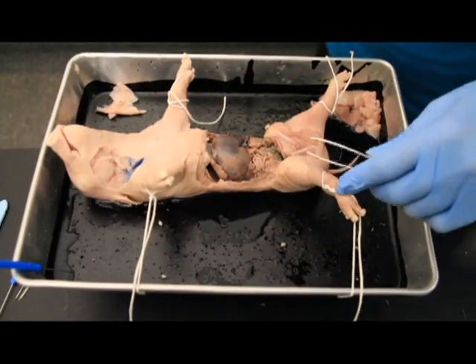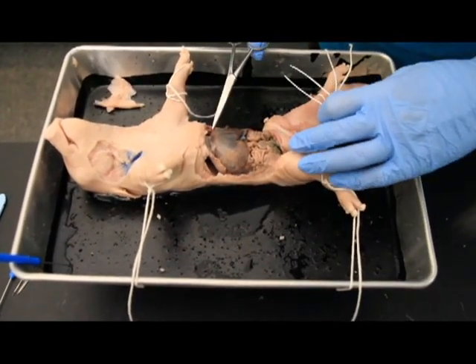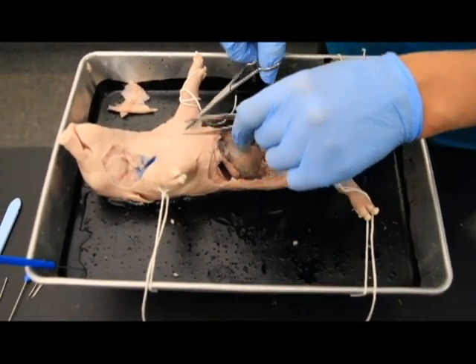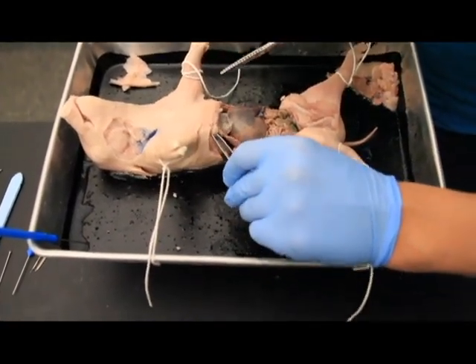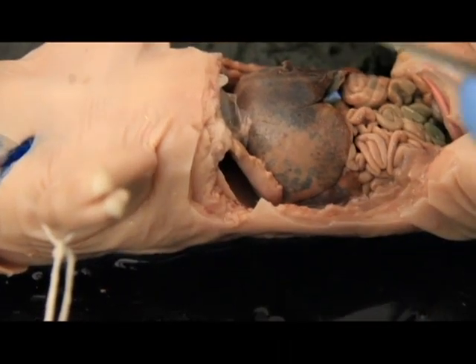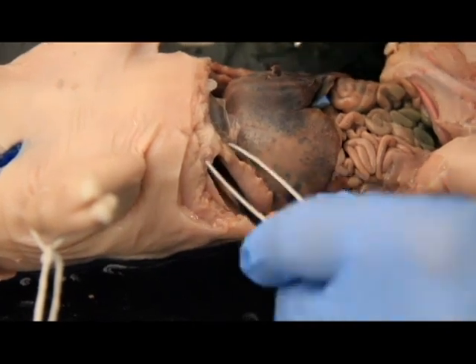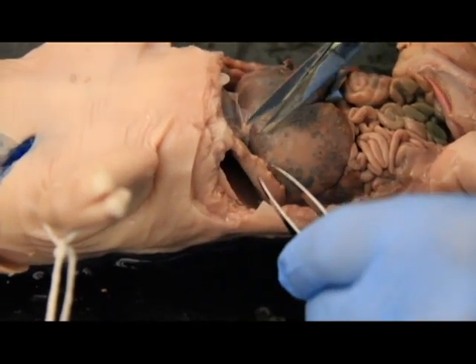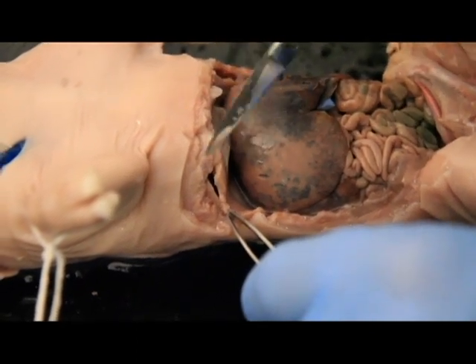Moving on to the chest cavity, it's surrounded by a similar chamber just the way the body cavity was. So once you break into that chest cavity, again, we're going to be able to look around and see our way. So what I do is I start way over here on the sides, because on either side, the only thing that you can possibly nick is the lungs. And we know what the lungs look like, or at least you will know what the lungs look like. And they're very large, so even if you nick one, it's not the end of the world. So this was originally covered here.